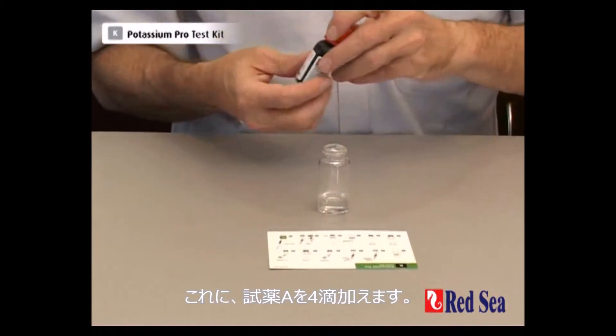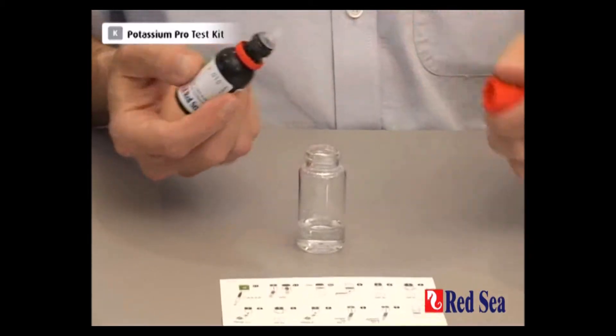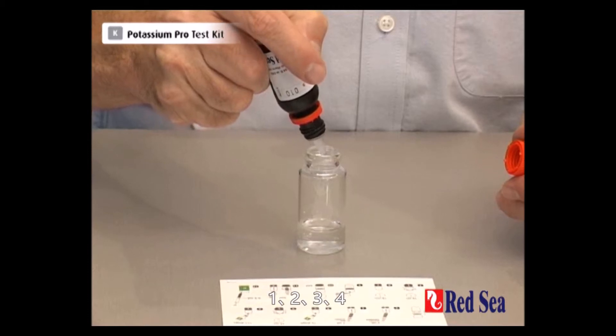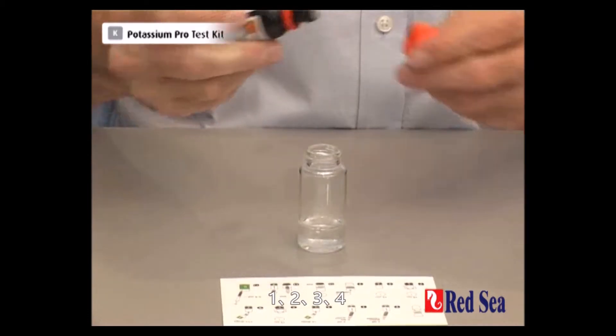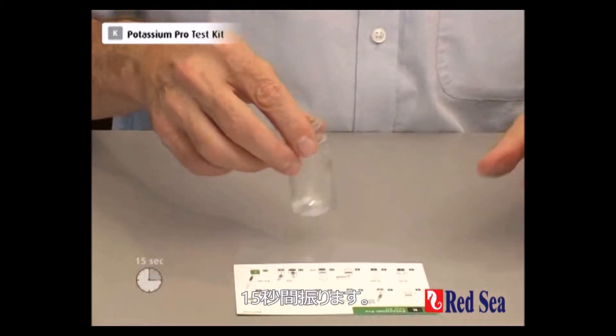We now start by adding 4 drops of reagent A — 1, 2, 3, 4. And shake for 15 seconds.